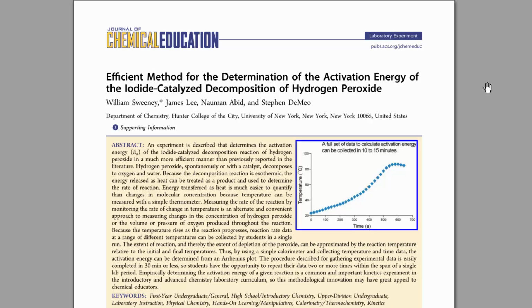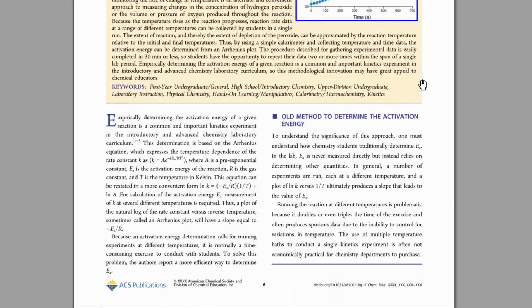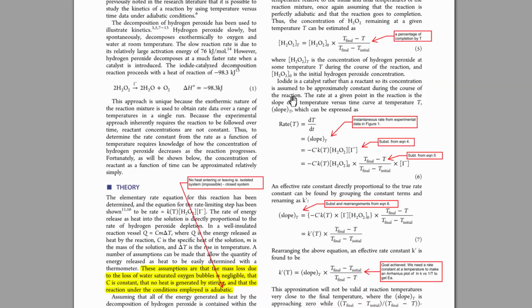This video is strictly for high-level IB chemistry students. Don't be scared by what this is, okay? The reason why you want to have a good look at this is this guy's actually found a way to quickly get lots and lots of data. And basically he's used a lot of mathematical derivations here.